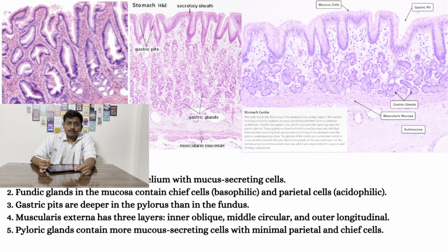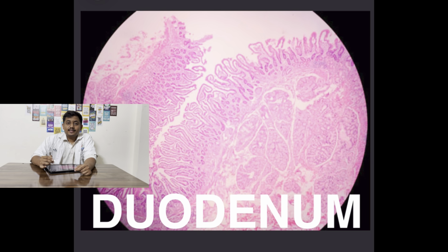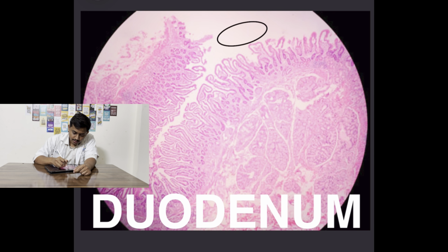So let's proceed with the third slide for today, that is the duodenum. So how can you identify a slide of duodenum? First, look for the lumen. Once you find the lumen, it is part of the GIT. Second thing you should be looking for is the villus. The villi are broader and leaf-shaped with a core of lamina propria. Here you can note the lamina propria.